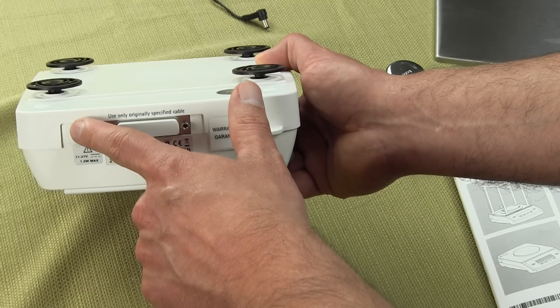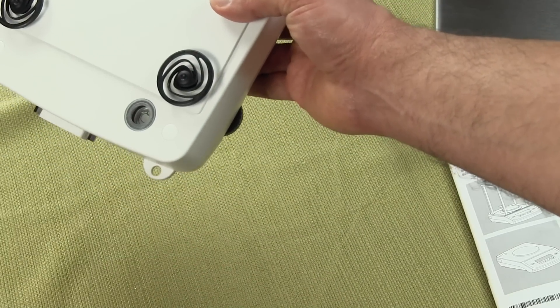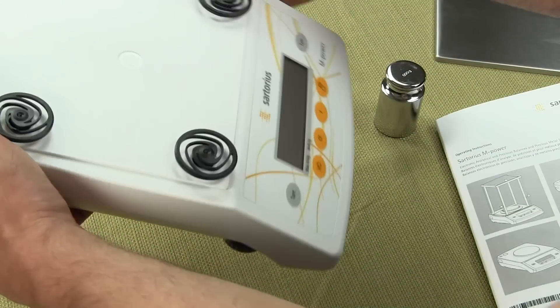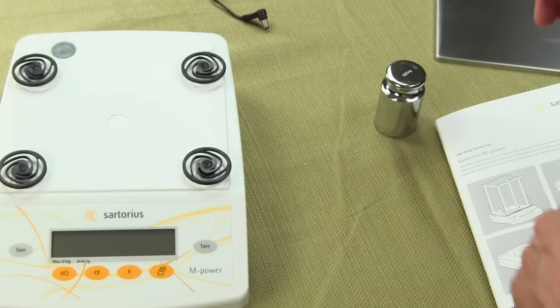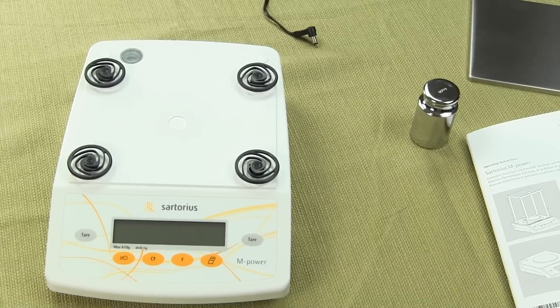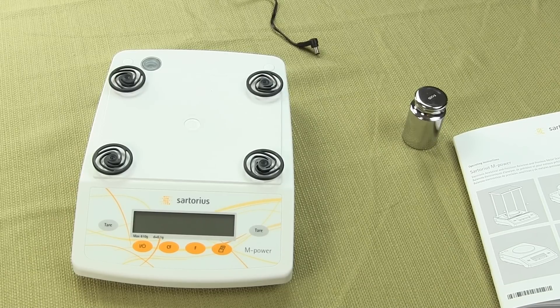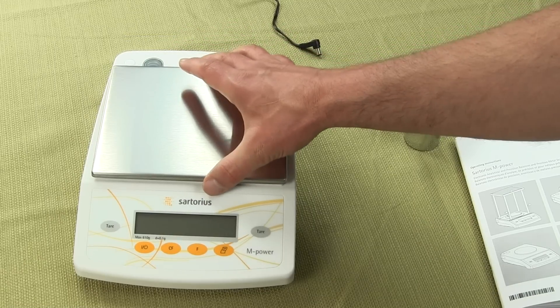You also have your AC adapter receptacle. And on the back of the scale, right here, is your spirit bubble indicator so that you can level the scale — it's a nice large spirit bubble indicator. The scale has four pads that the pan rests on. It doesn't have a ton of advanced features, but it can do the job. Sartorius markets this as an entry level model, and it has a nice removable stainless steel platform.